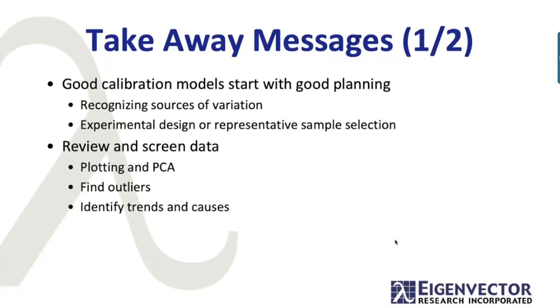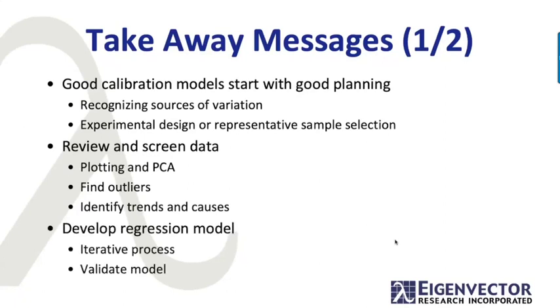So once you've done your design and measured your samples, review and screen your data, try to do it as the data is coming in. Use plotting and PCA, find outliers, identify trends and causes of the trends in the models or in the data to the extent that you can. And then develop your regression model. That's an iterative process. It might take you a while.